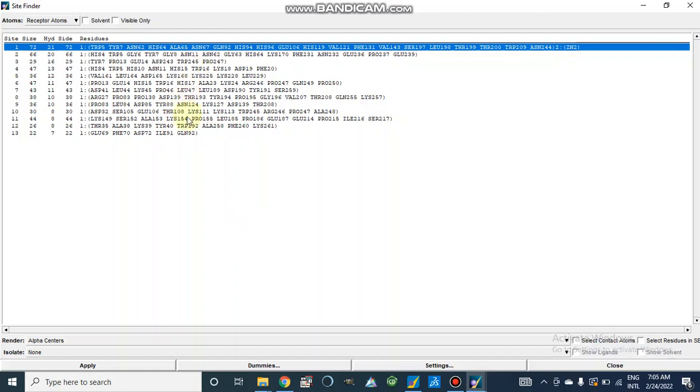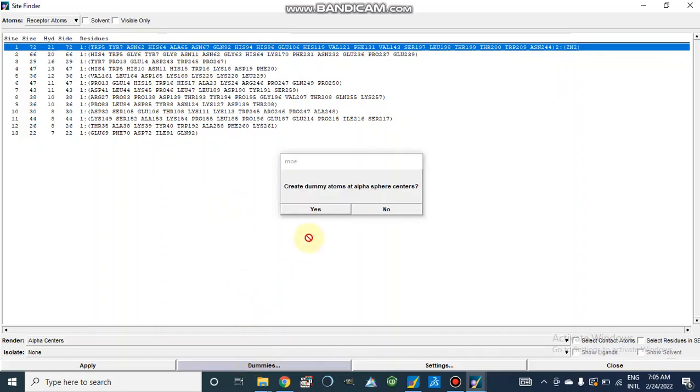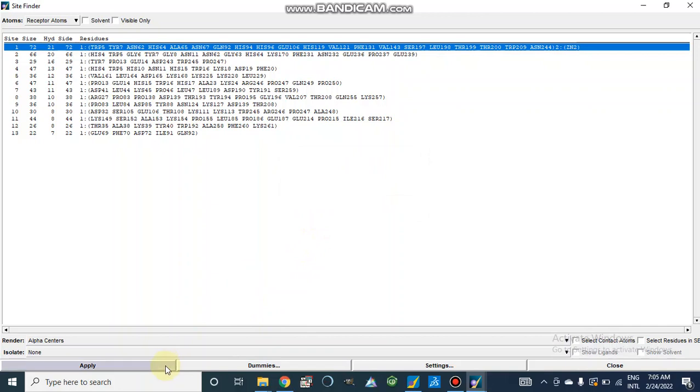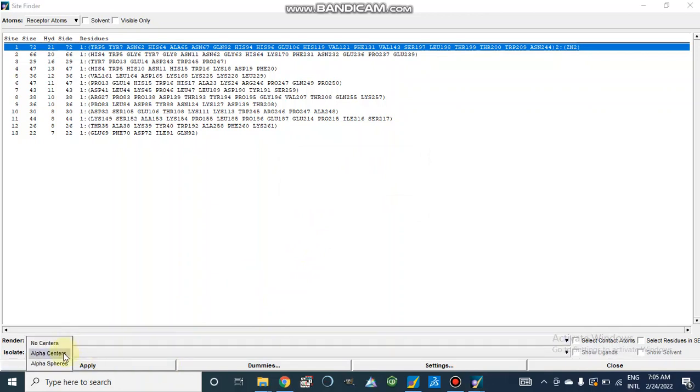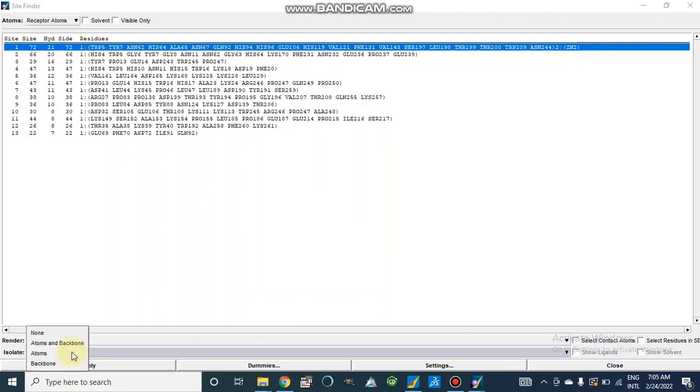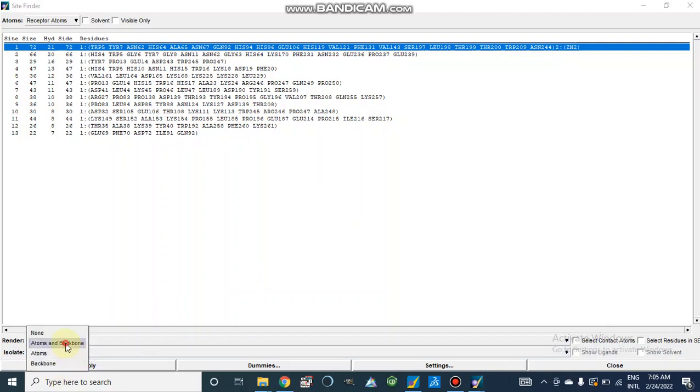So we will select the active site which contains our residues. From here, we can obtain alpha center or alpha spheres. And this is isolate atoms and backbone.